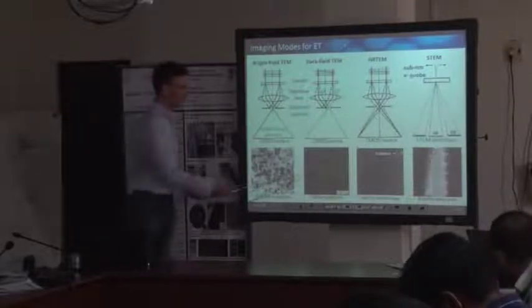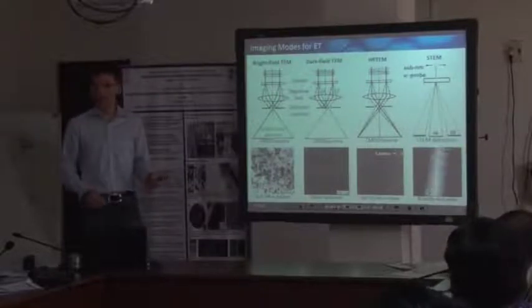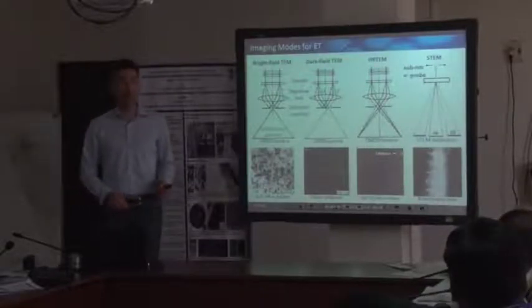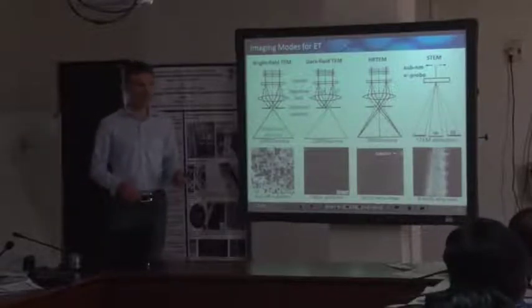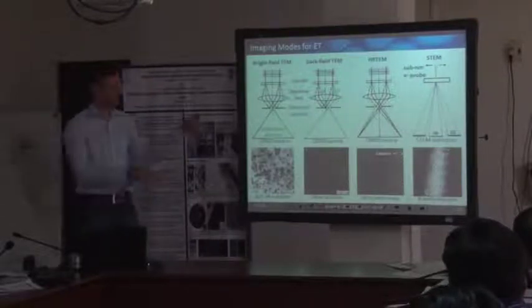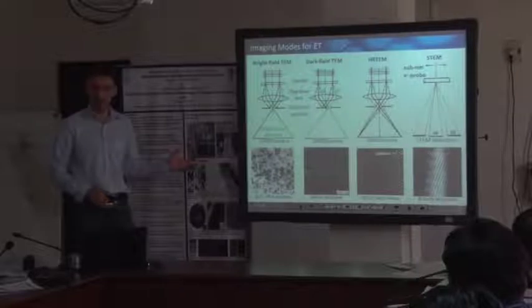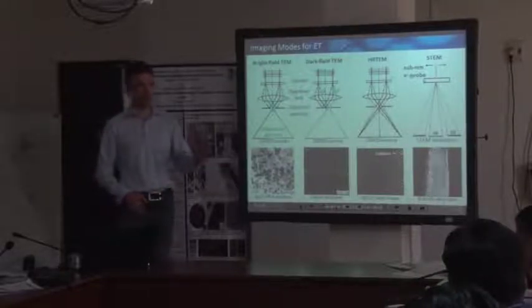In principle, depending on your material, you might use every imaging technique that is available in your microscope. It has in principle only to fulfill your projection requirement. This would be the best, like even for the titanium oxide, this was an earlier example. In principle, you would go for a pure Z-contrast imaging mode.